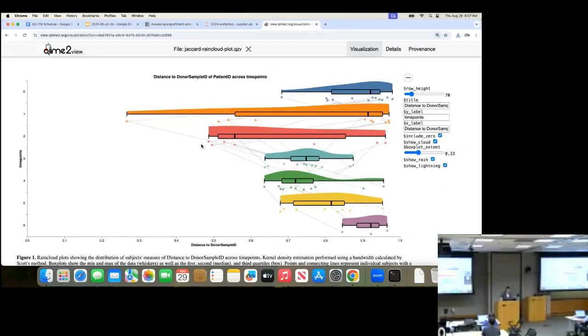Awesome. And I'm gonna zoom in just a little bit so that we can talk about this. I kind of want to describe our time and place in this FMT. So I'm going to walk us through what all of the rain clouds mean.